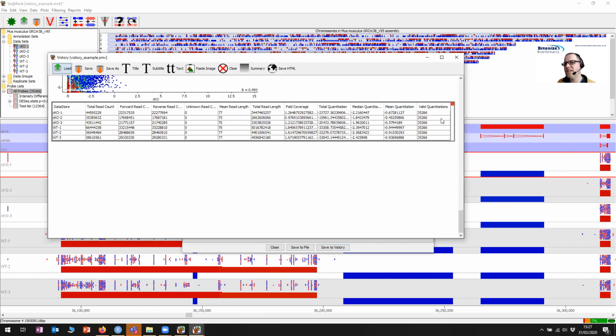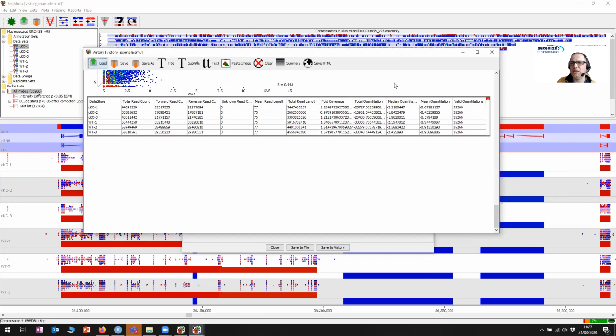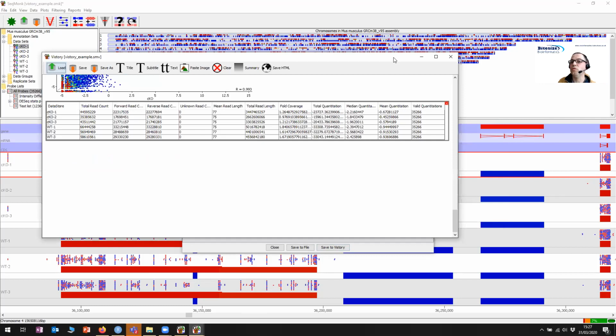If it's a really big table, I'll have a scroll panel that goes inside here so that it doesn't just completely take over. But this small one will go in directly. Often what we're doing when we put these tables in is that we are trying to show the results of statistical analyses and combined statistical analyses.